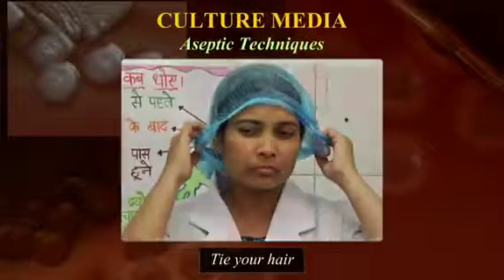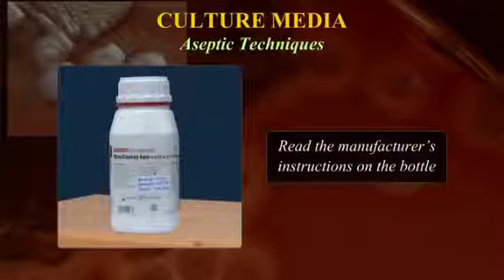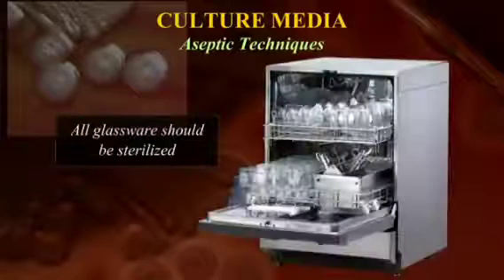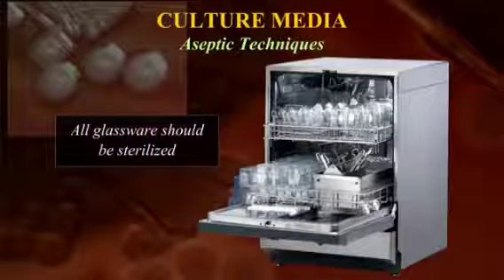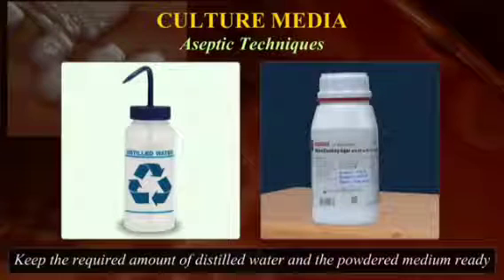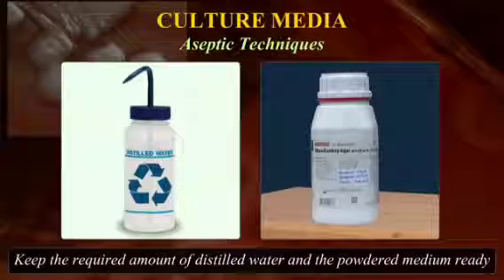Before preparing any medium, read the manufacturer's instructions on the bottle carefully. All glassware required should be sterilized. Keep the required amount of distilled water and the powdered medium ready before you begin preparing the medium.